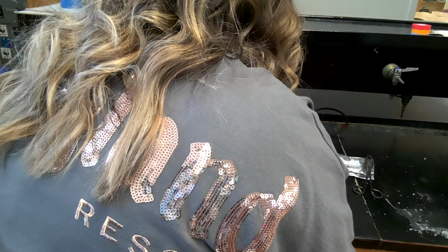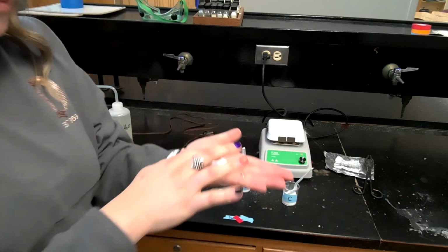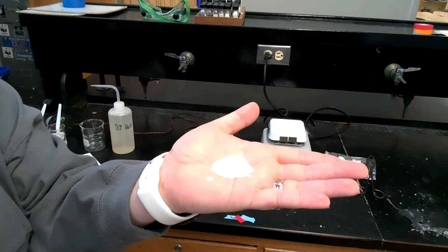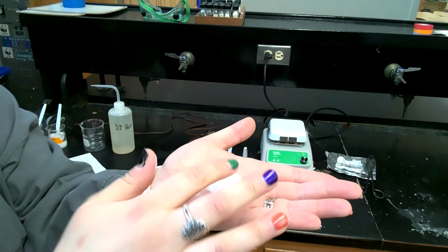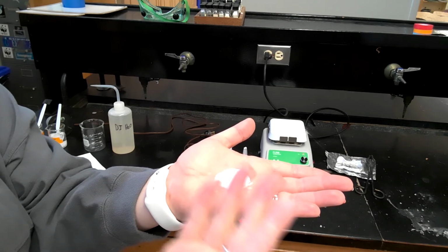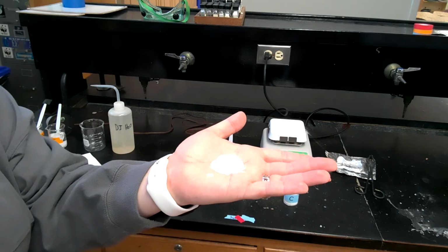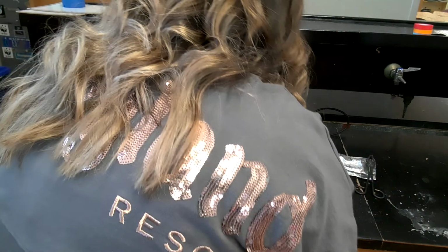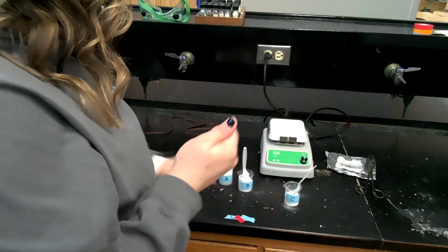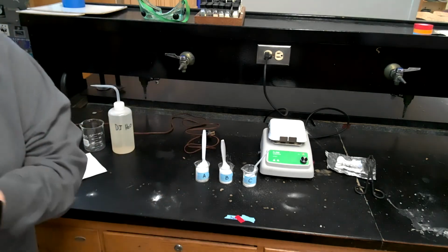And then last but not least is substance C. So substance C looks very powder-like to me. It's very soft, kind of has like a velvet type of texture to it. And it looks like it sticks a little bit more to my hands, and it leaves kind of a residue, and its appearance is also white. So that's the texture and appearance for all 3 of these. So that's one of the ways that you can identify the 3 substances based off of their appearance as well.